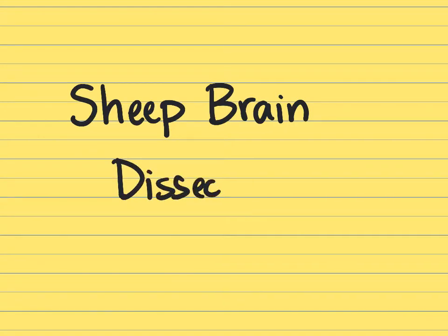In this video, we're going to be doing a sheep brain dissection. So first we're going to talk about the four main brain divisions that we're going to be looking at as we go through this sheep brain dissection.